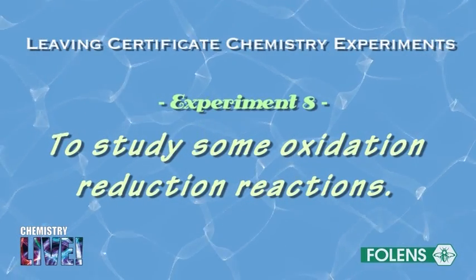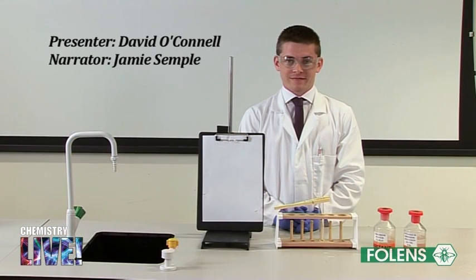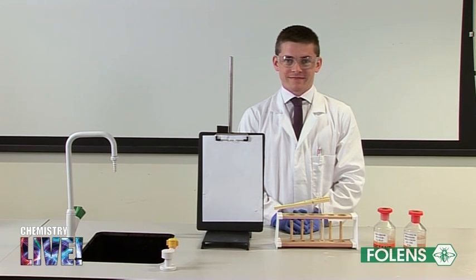Experiment to study some oxidation-reduction reactions. In this experiment, we shall study some oxidation-reduction reactions involving the halogens, group 7, as oxidizing agents. We shall also study some displacement reactions of metals.